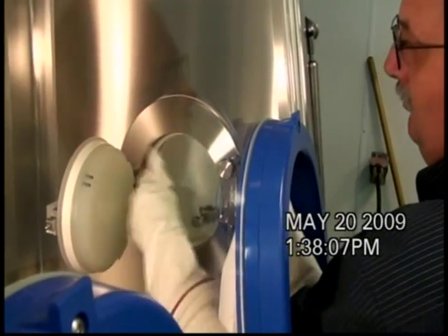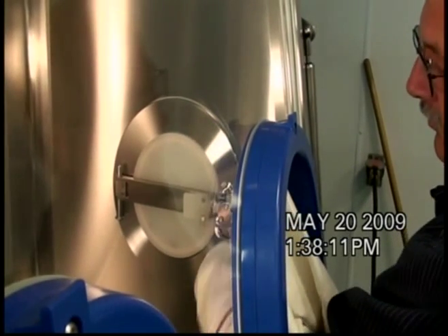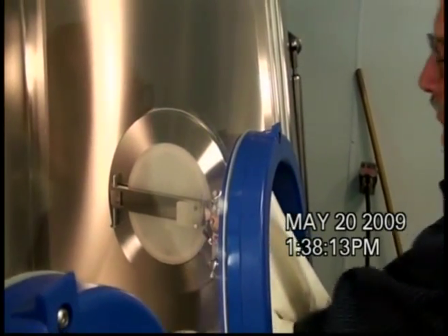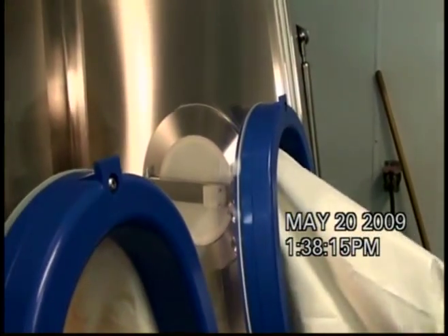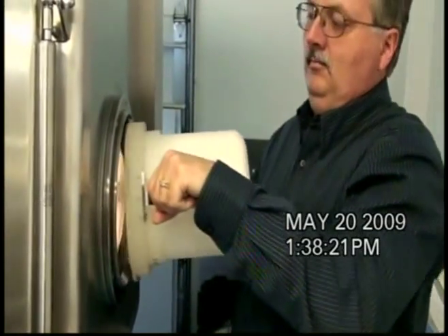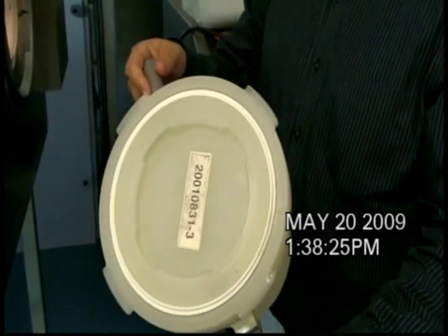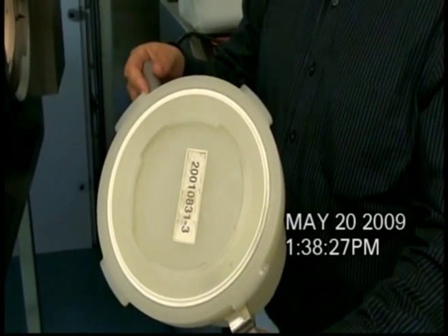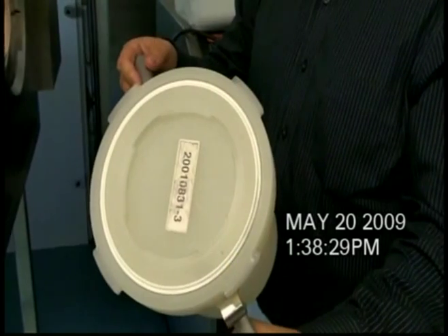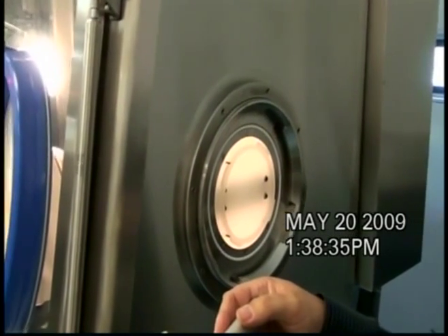Taking a tri-clamp part, putting it inside the container, and closing the door. That tri-clamp part can now be taken out of the isolator, sealed in the container, and taken to another isolator for further processing — without exposing either the container or the inside of the isolator to the outside world.